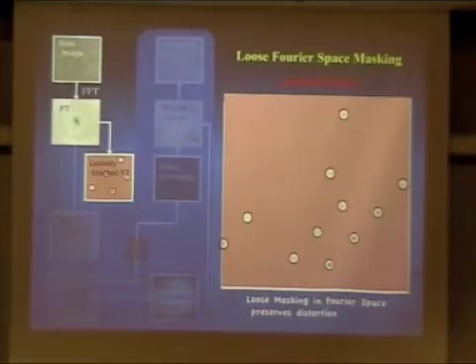Then in Fourier space this will show up at the exact frequency of your lattice point. Now, if you are slightly off, then it will show up at a frequency that's slightly larger, or the other way around. Because we know they are not off by a lot, I don't have to cover the whole area. We only have to make it a little larger than where our lattice spots are.